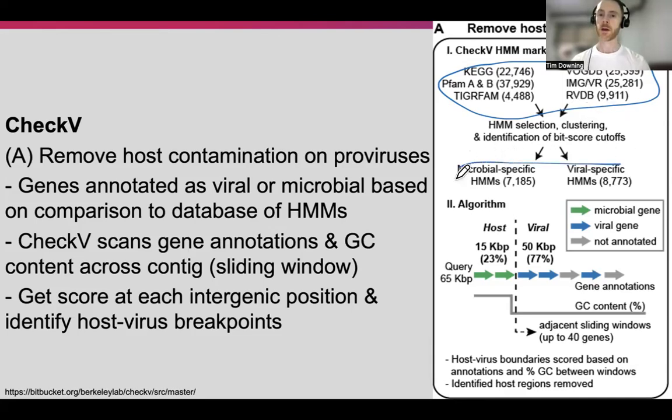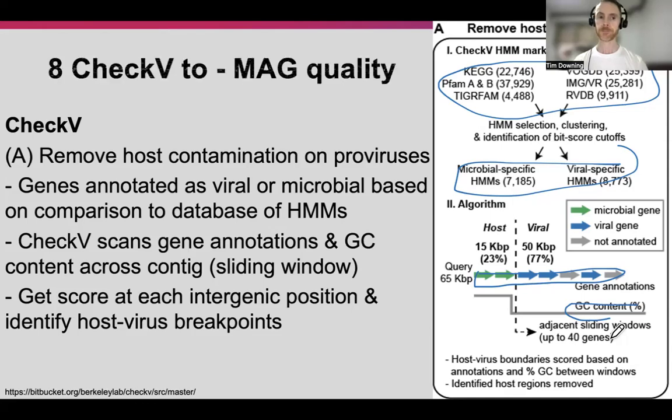These are both virus and host, and therefore it can look at contigs that are either virus or host, or mosaics of them where we've mixed up the virus and host genes together, which, unless you're talking about retrovirus, shouldn't really happen. That can be explored by looking at gene annotation, gene similarity, and GC content as well.